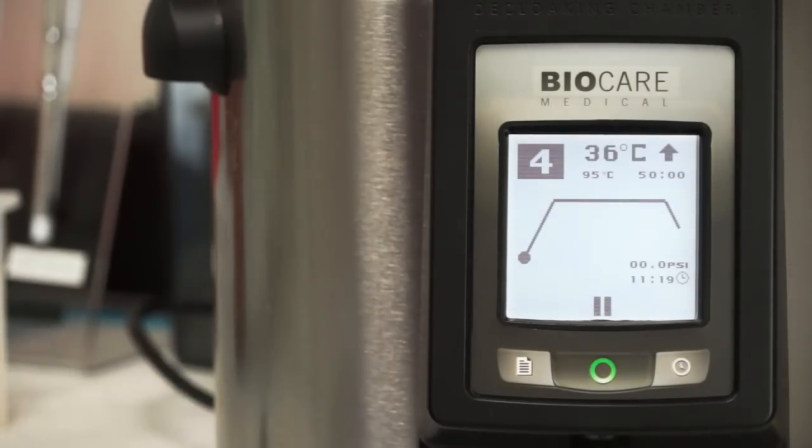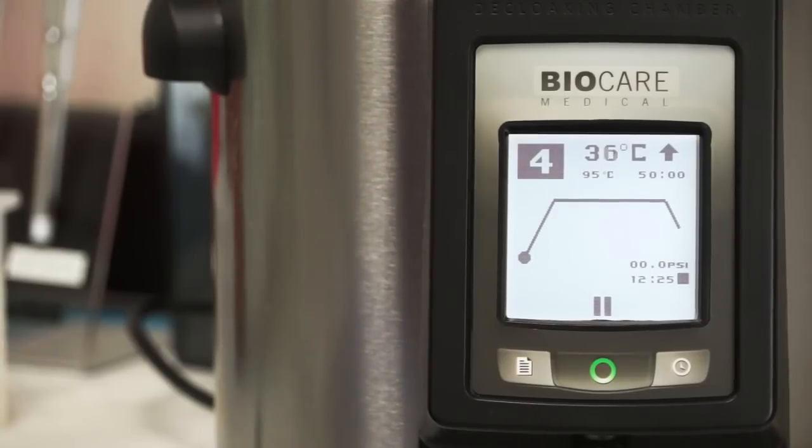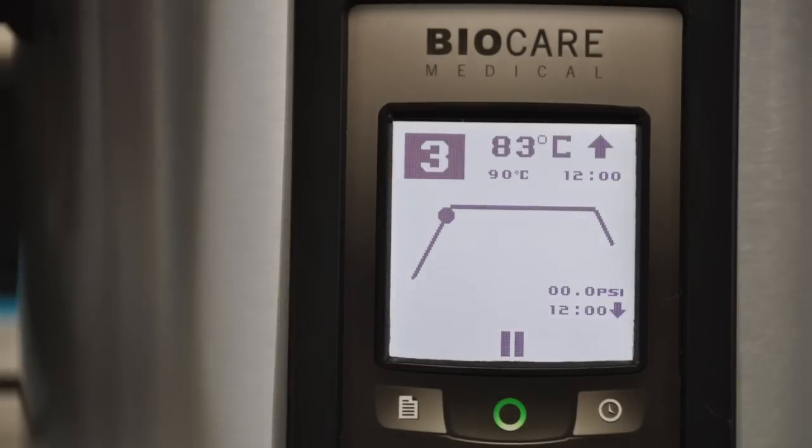While the run is in progress, the front screen of the decloaking chamber next-gen provides real-time information about the temperature of the pot as well as the time remaining in the run. It's illustrated here by time-lapse video.